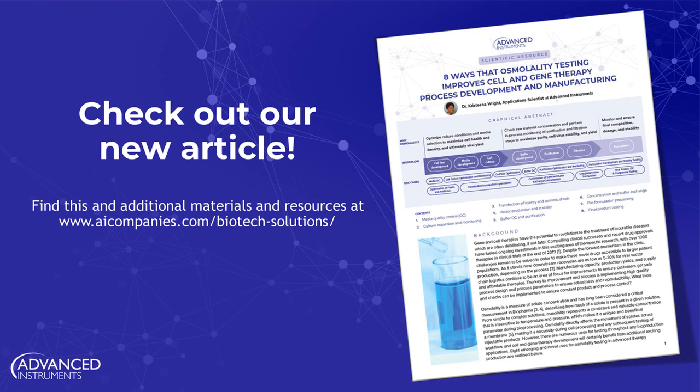Thank you, Christina. It was really exciting to hear all these lovely new use cases and opportunities for osmolality to be implemented across the cell and gene therapy workflow. And we do have some great questions already. I'd like to start with the very first one. How can osmolality of the transfection complex be altered to improve titer in real time, especially with PEI Pro, which has a very short incubation timing prior to addition to the production culture?